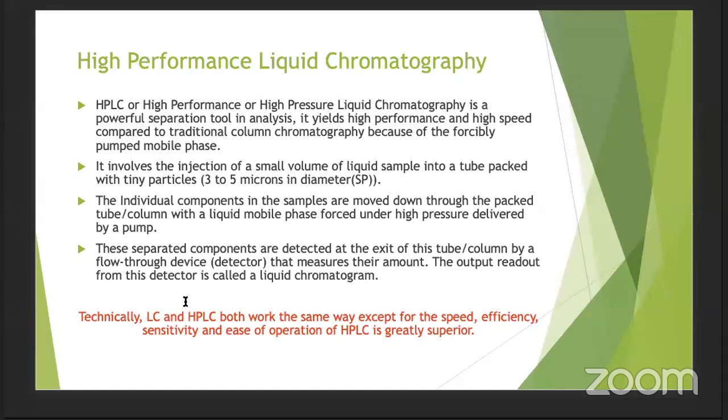So HPLC is high performance liquid chromatography. This technique is basically used for separation, identification, and quantification of a component from a mixture of components. Suppose you have a mixture which has different types of components in it, and you want to isolate a single component from it and identify if it is a protein molecule or a phytocompound or something else.